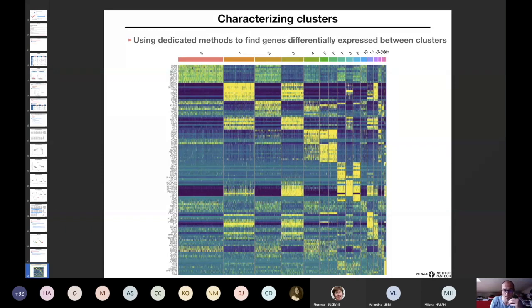The top 10 genes. But already you can see and spot some of them. You see, for instance, IL7R, for instance, granzyme K. So maybe the cells expressing strongly this set of genes here, cluster number 2, well, maybe this cluster corresponds to T cells, maybe. So that's one way to do it, and scan this heat map to see if we can identify markers that help us to characterize the clusters.